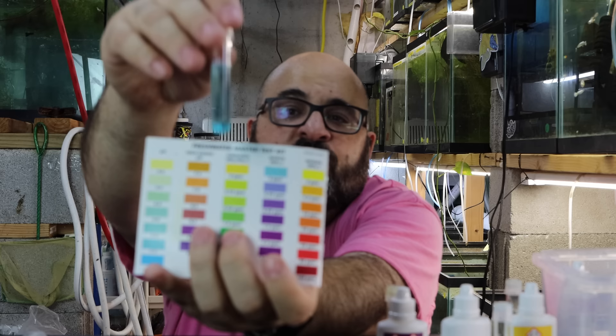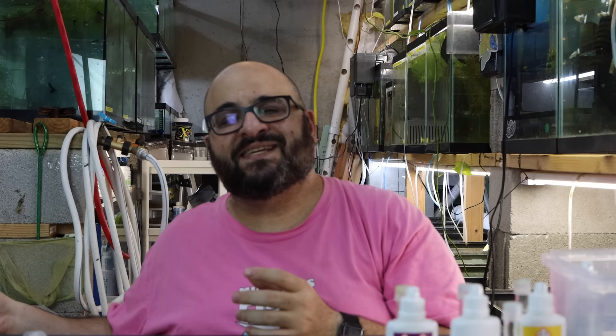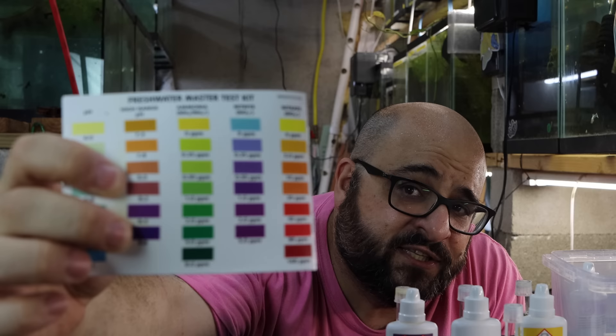Now let's look at the nitrite test. Light blue is what you want for zero — nitrite is deadly to fish. Taking the test tube, you can see it's light blue — we have zero nitrite. Now nitrates are a little more tricky. Some people say under 20 parts per million, some say under 40, some say under 80. The difference between 40 and 80 on the color card is virtually nothing — it's hard to tell.